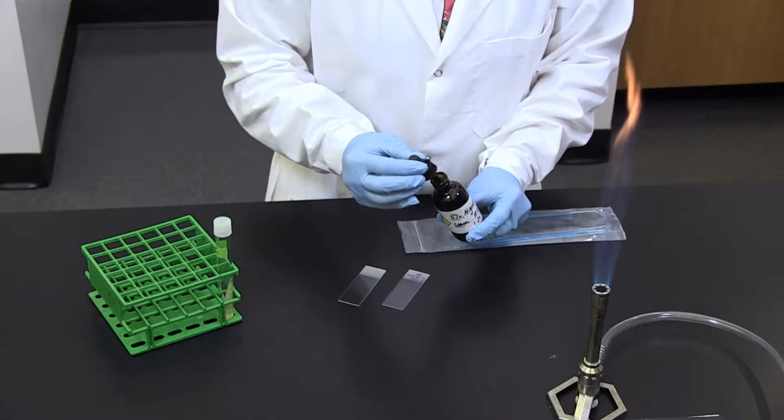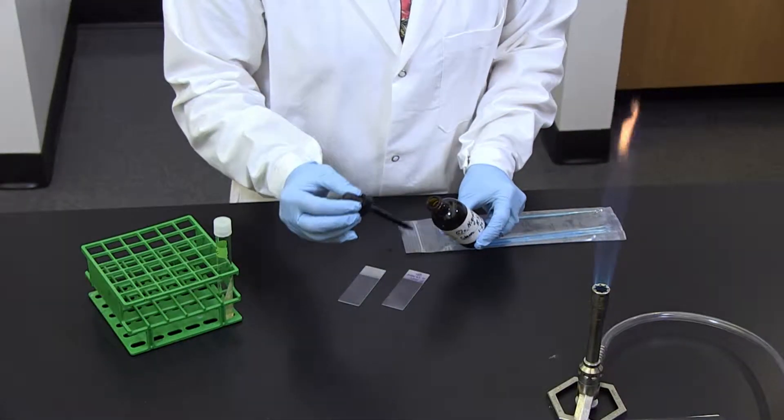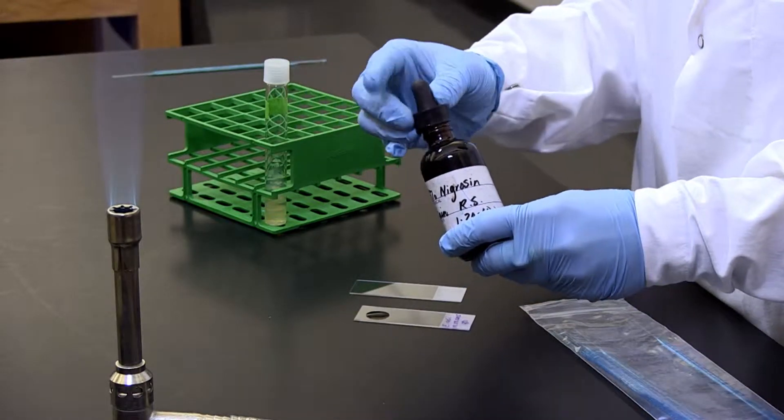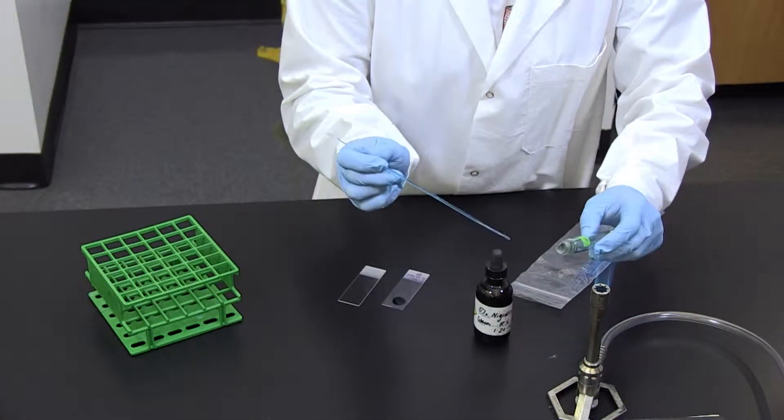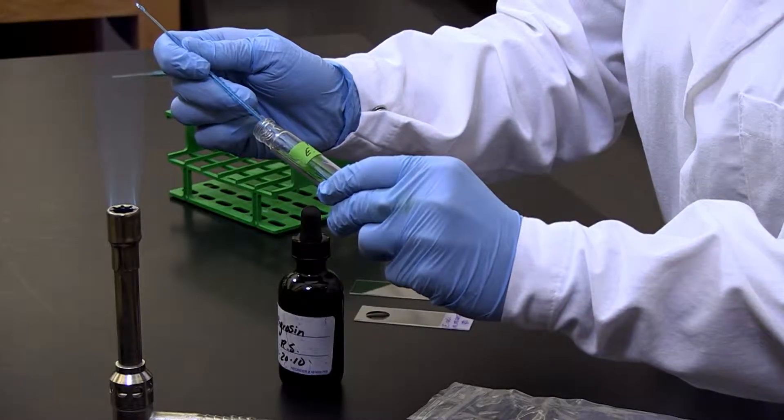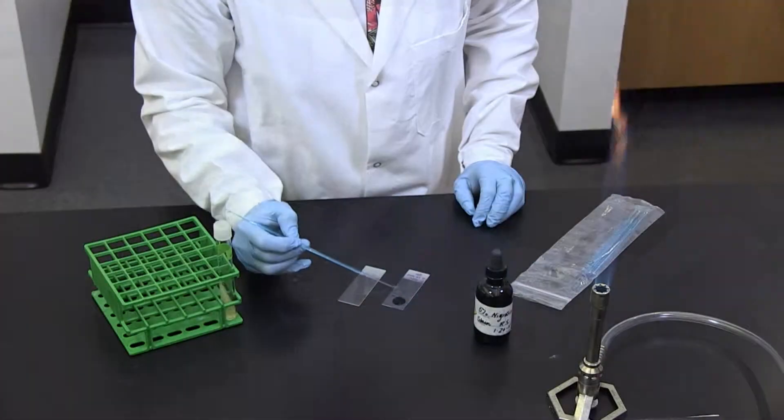To prepare a negative stain: One, place a single drop of nigrosine near one end of a clean microscopic slide. Two, use a needle to disperse a small amount of bacterial cells in the dye.